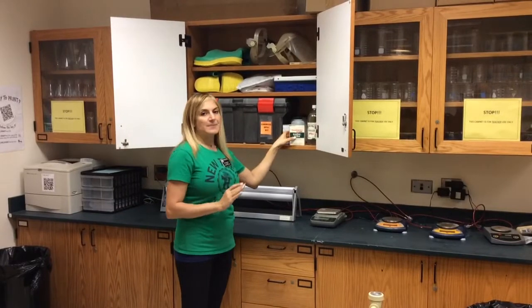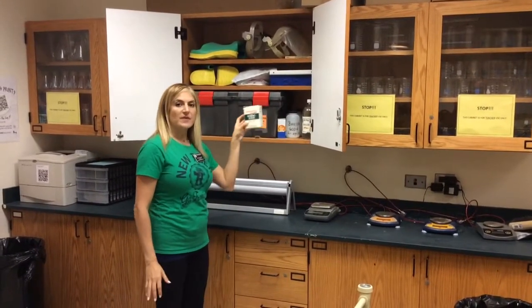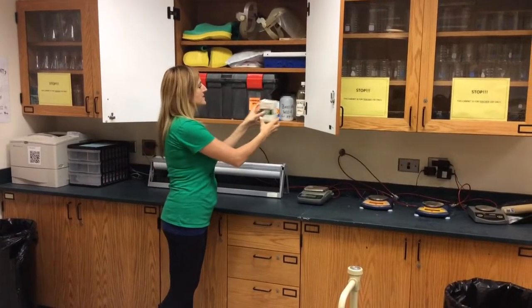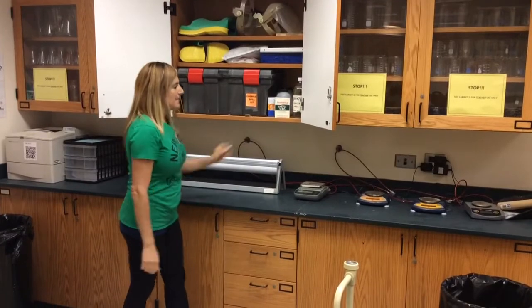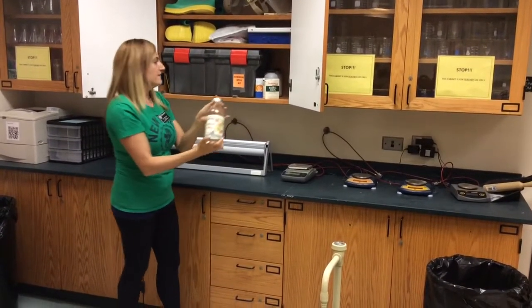So you want to use the opposite. So if you spill an acid on your station, you neutralize it with a base. So you use the opposite. Sprinkle a little of this. If I spill a base at my station, I neutralize it with a safe acid, vinegar.